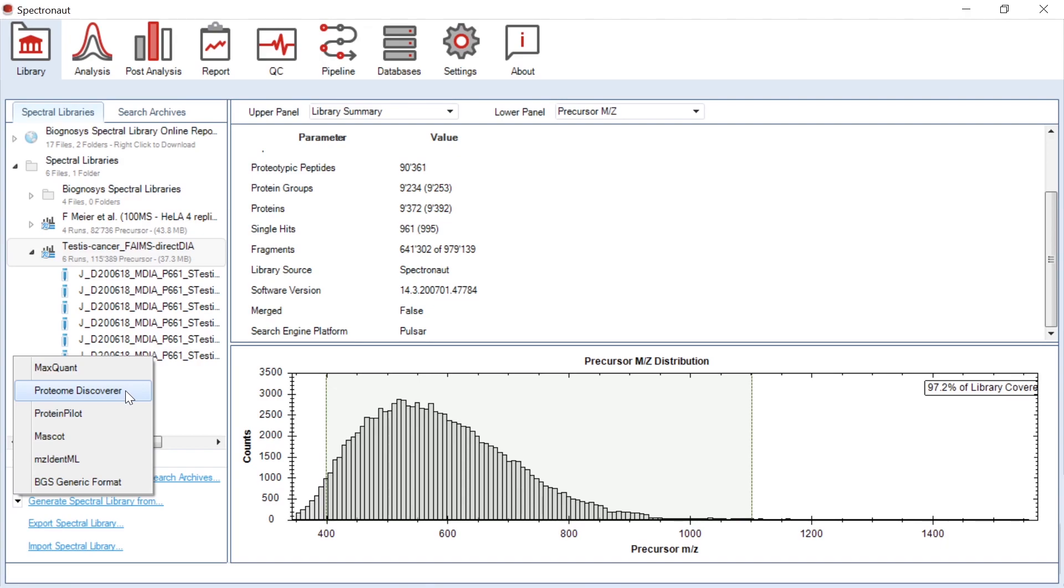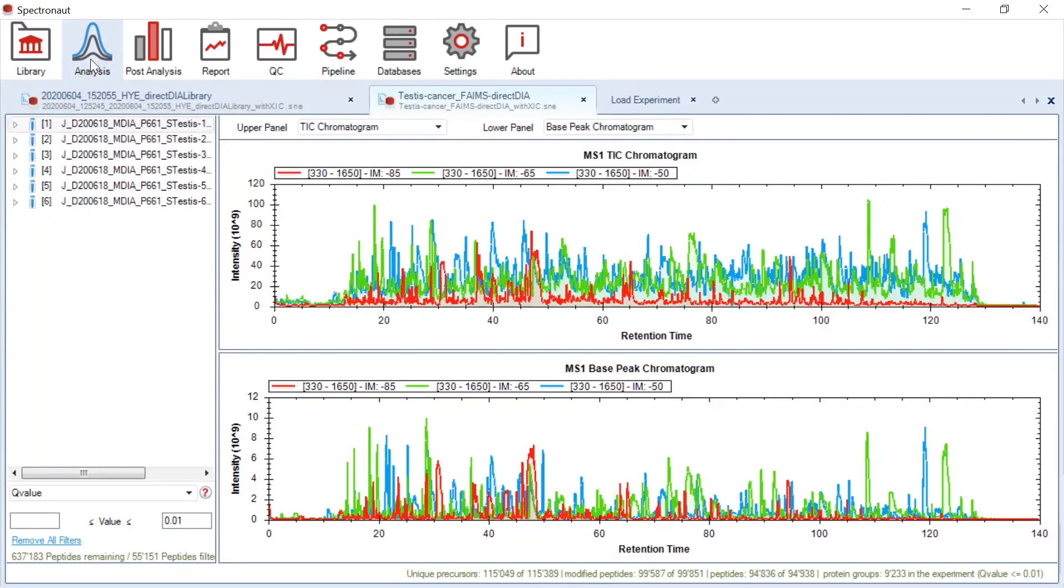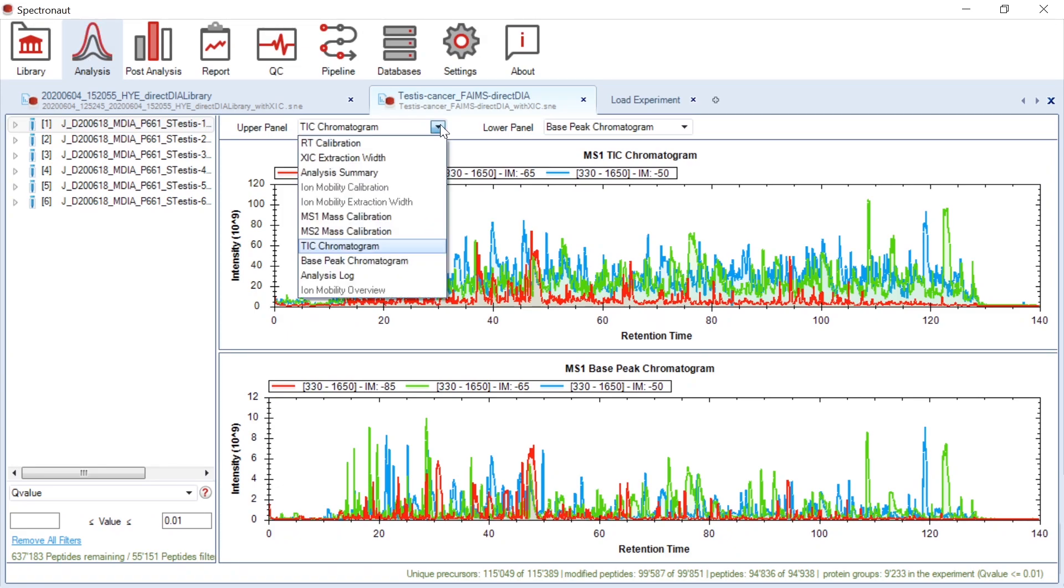The graphical output in the software doesn't differ much from analysis without FAIMS application. As you can see, you may scroll down the panel menu to visualize among others RT, MS1 or MS2 calibrations.